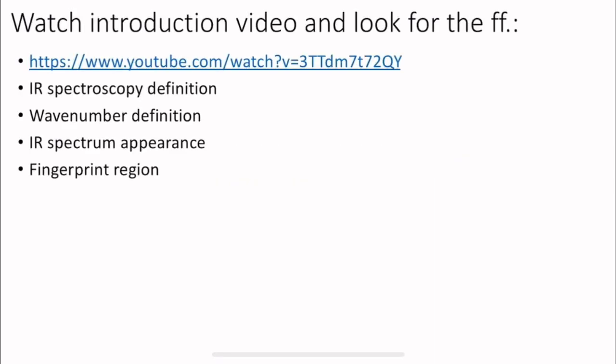Good day everyone. In this video, we will talk about IR spectroscopy. Let's start with this introduction video and watch out for the following basic concepts. First, what is IR spectroscopy? What is a wave number? What does an IR spectrum look like? And what is the fingerprint region in an IR spectrum?